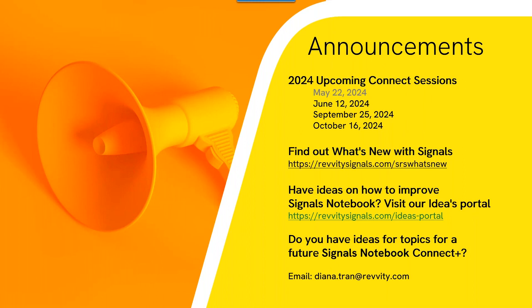Thank you, Zav. When entering data, how does Signals Notebook make it easier on scientists? Gosh, that is a big question. So it does it a couple ways. Nobody wakes up and goes, gosh, I can't wait to fill up my notebook, right? Everyone knows it's a necessary challenge. So I think what I've shown you today is a couple things.